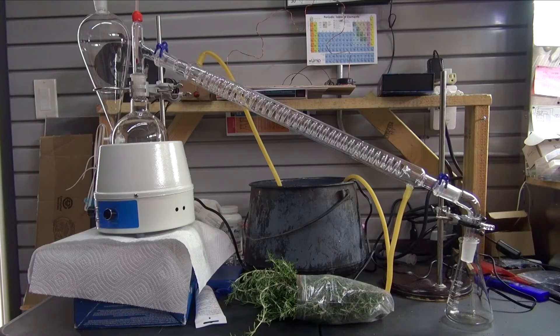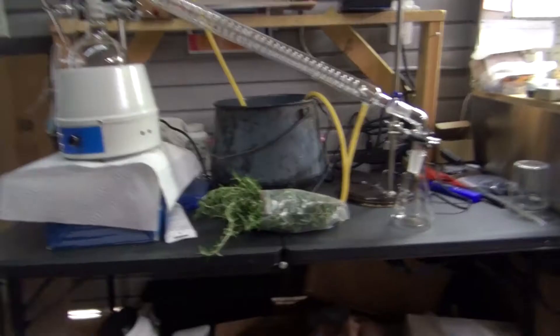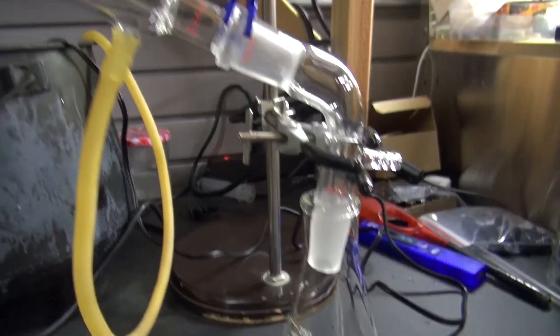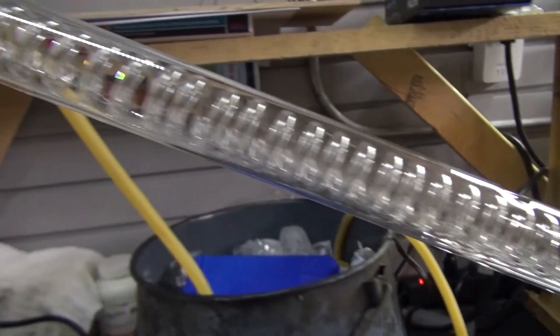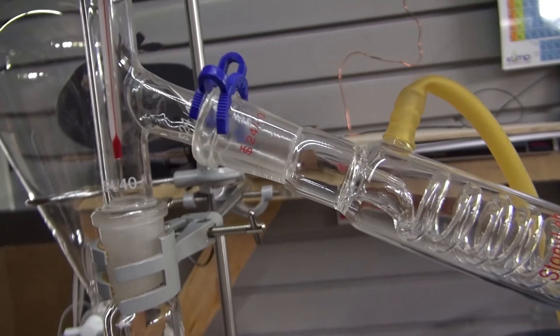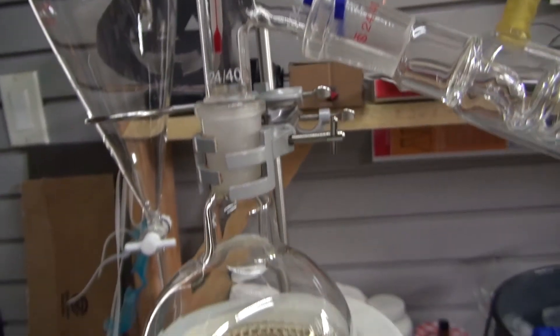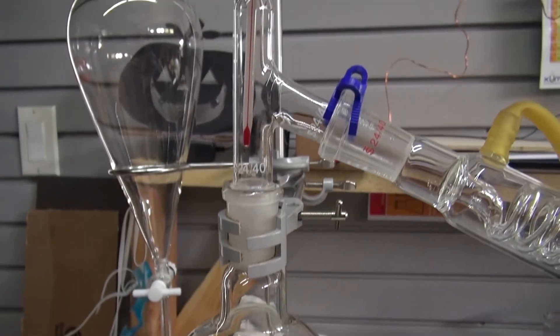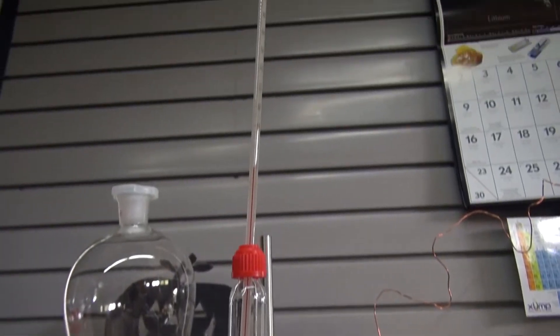These are the items you're going to need for this project. You'll need an Erlenmeyer flask connected to a vacuum takeoff joint connected to a Graham condenser connected to a thermometer joint connected to a Florence flask, and of course a thermometer to measure your steam.